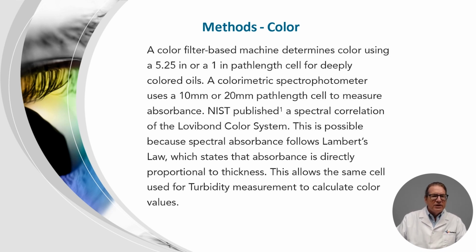This measured data follows Lambert's law, which states that absorption is directly proportional to the thickness of the sample. This allows a user to measure using commonly available cells with 10 millimeter or 20 millimeter path lengths, including disposable cuvettes, and other cell sizes as well, such as 24 millimeter vials, 33 millimeter, or 50 millimeter cells.